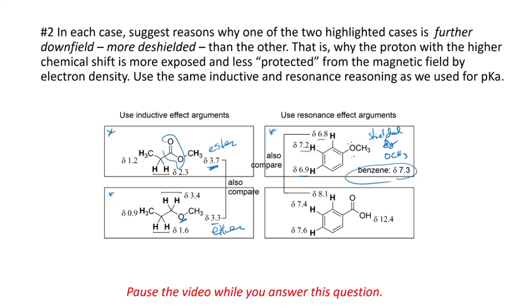And notice that they're not the same position. That's because 2 of them are especially shielded, aren't they? They're to the right of 7. This is very unusual for a benzene ring. Well, if you write the resonance contributor, you see that the electron density has been placed right on the carbon that is where the hydrogen is shielded at, because that carbon is donating more electrons to the hydrogen, shielding it from the magnetic field. And we have another resonance contributor that would bring us to this other position as well. And so both of these are partially negative, and that's the shielding business.